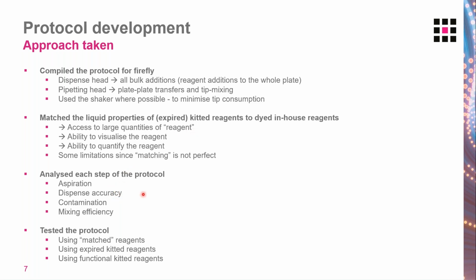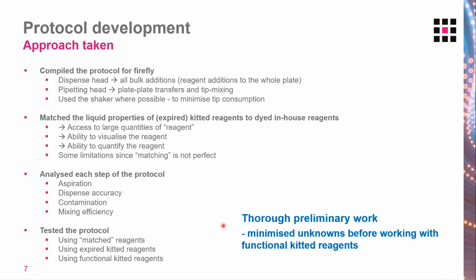We can also look at contamination because we've got our dyed reagents, so we can see if there's any splashing of reagent. And also, the presence of a dye makes it easier to determine whether any mixing steps we're performing have been conducted thoroughly. So we test protocols using these mock reagents, some expired kitted reagents, and only then do we move on to use functional kitted reagents. I'd say this preliminary work is really thorough, and in doing this, we can minimize the unknowns before we're working with these more expensive kitted reagents.